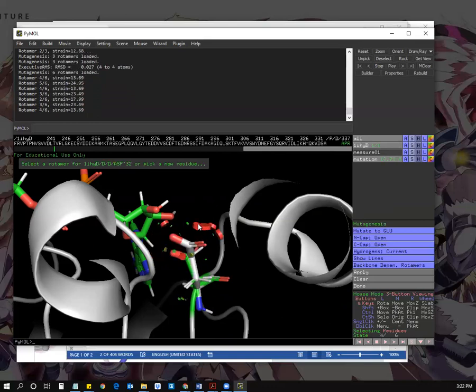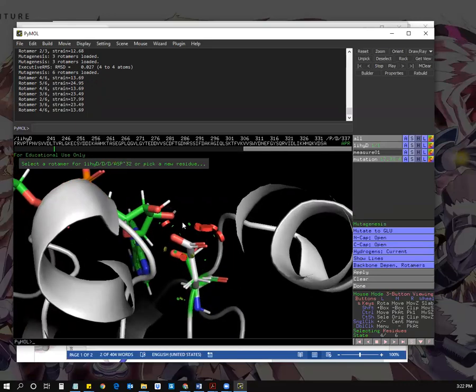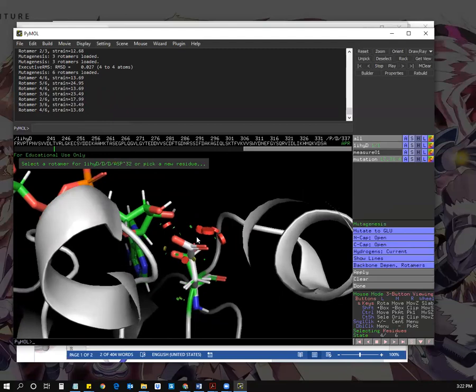But just be careful. If anyone's wondering, these short red cylinder discs that pop up are just showing you molecular strain. There are some quantifications associated with this that come up, but we're not having you jot down any of these or do anything with this for this lab in and of itself.